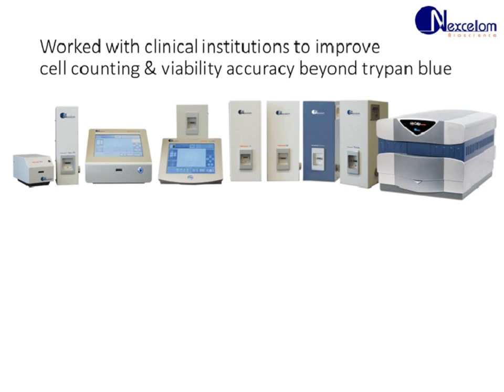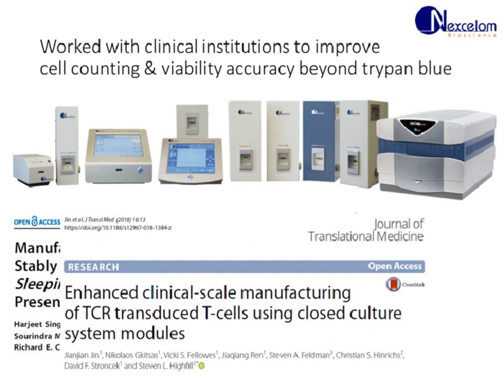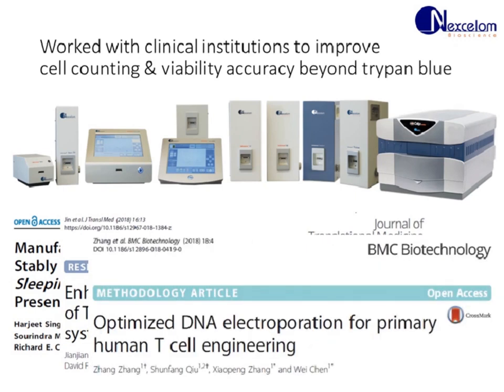There have been multiple publications on this type of method using automated cell counters, such as MD Anderson looking at T-cells using the Sleeping Beauty expression to look at cell counting and viability, as well as TCR transduced T-cells, and finally T-cell engineering. All of these cell-based assays require a very accurate and rapid method to look at cell count and viability.